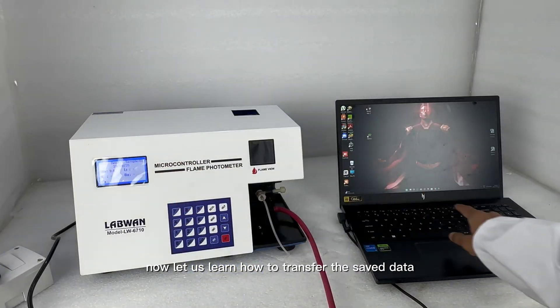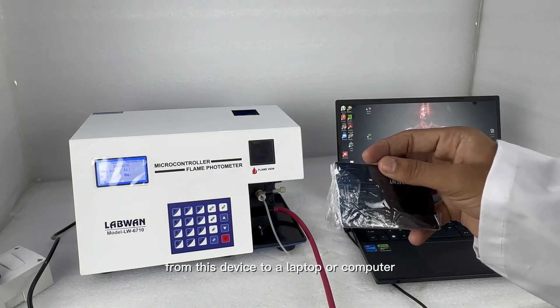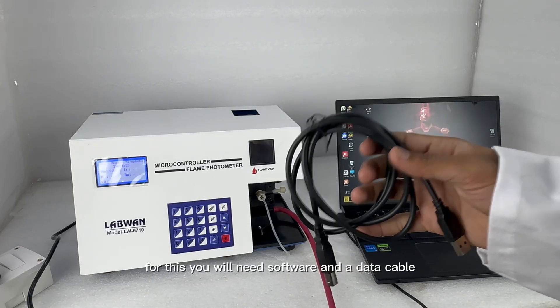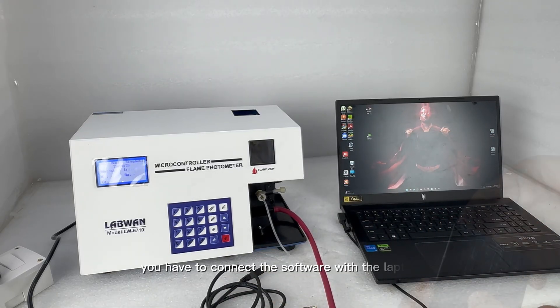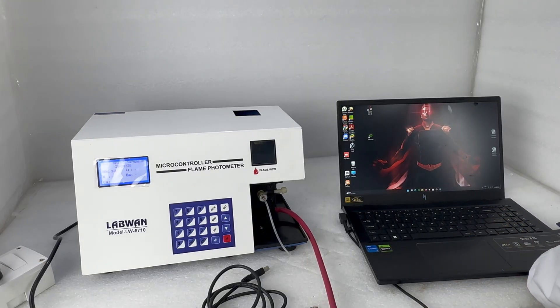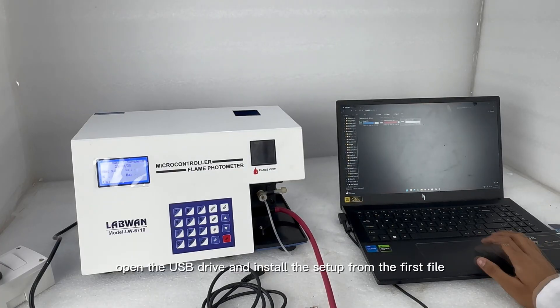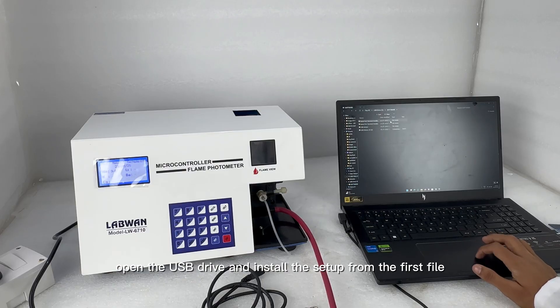Now let us learn how to transfer the saved data from this device to a laptop or computer. For this, you will need software and a data cable — connect the software with the laptop. Open the USB drive and install the setup from the first file.